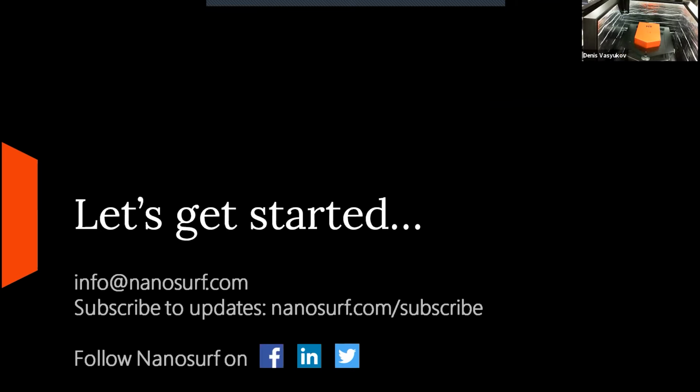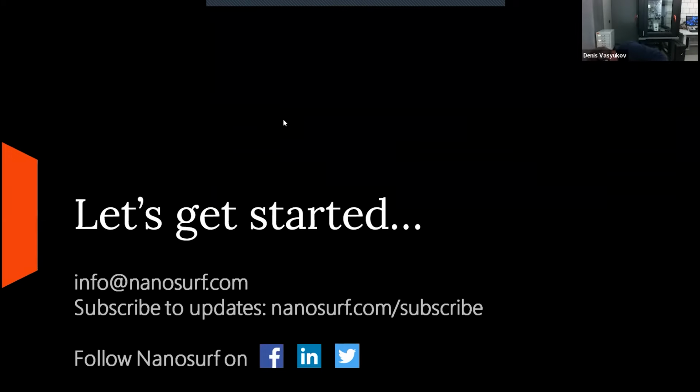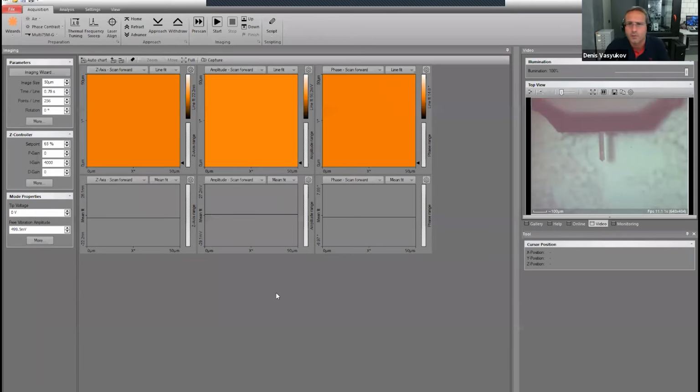And I'm going to close the acoustic enclosure, so we don't have any noise. And I'm going to switch back the camera, so you see my face instead of the black box. And we go back to the Nanosurf imaging software.